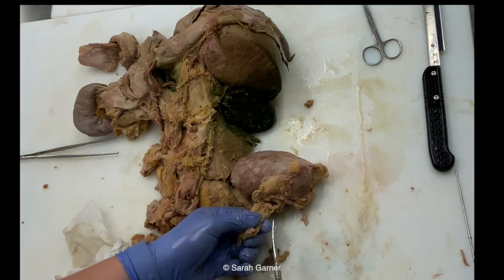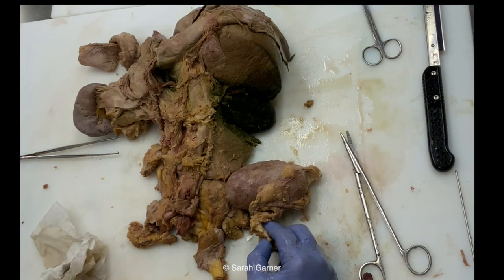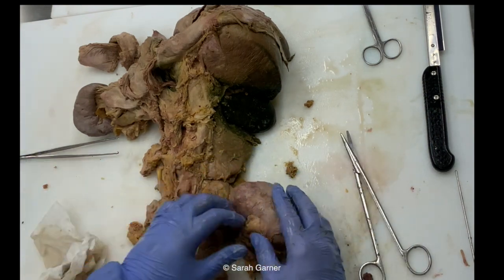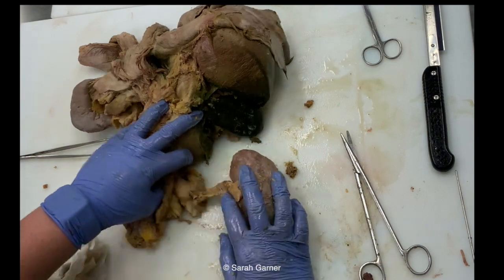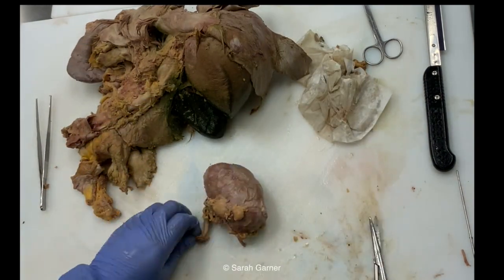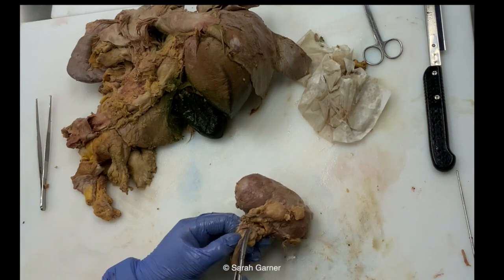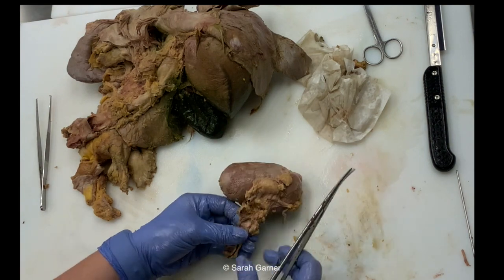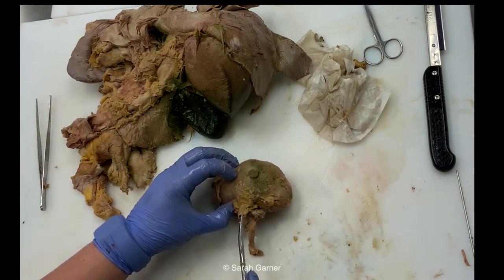So we'll actually go ahead and open up the individual vessels, inspect those, and then we'll open up through the ureter, bivalve the kidney or bisect the kidney, and peel off our capsule and look at the cut surface. So I'm going to do the same exact thing here. So I'm opening up your renal artery right now, and then the branches of the renal artery splitting here, checking the inside, nothing abnormal. Do the same thing with the vein.